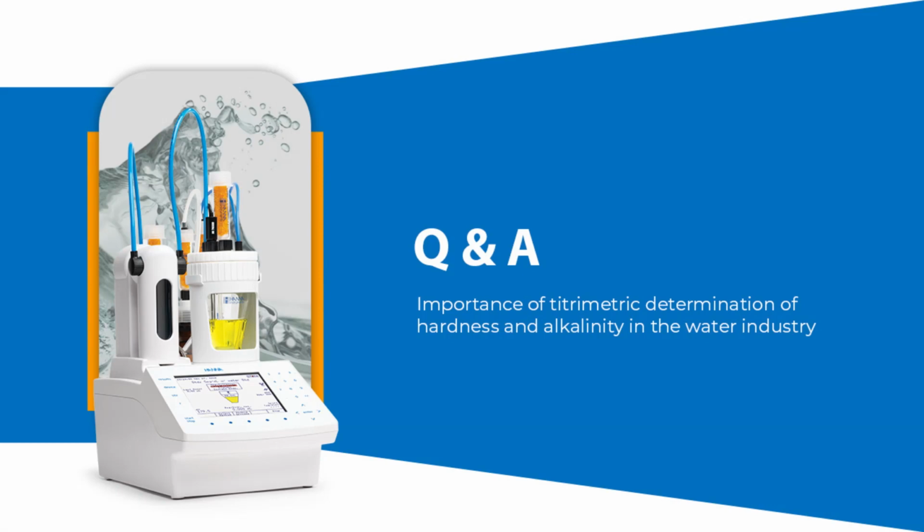Okay, then there is a question from Narendra sir. What is the difference between titration and titrimetric? Basically, titrimetric is the method of analysis by using the titration. So titrimetric and titration are not different parameters. They are the same. We are just giving a terminology, titrimetric, which means the analysis that is done by using the titration.